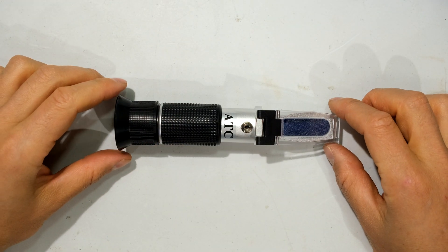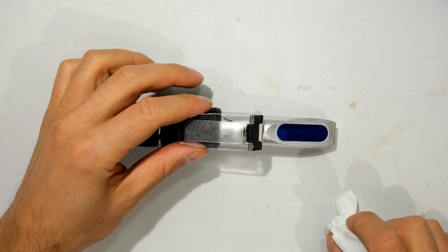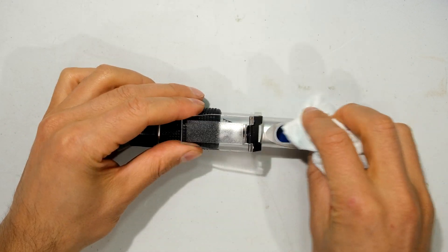Now I'm going to show you how to take a measurement. The first thing you want to do is make sure your prism and daylight plate are clean. I clean it with distilled water.